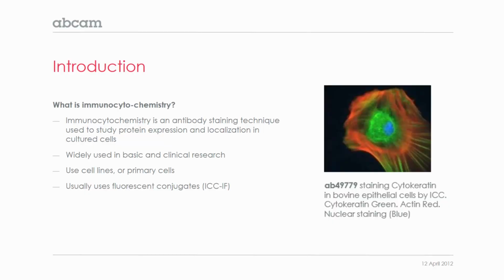So how do we define immunocytochemistry? We would classify it as an antibody staining technique that's used to study protein expression and localization in culture cells. It's very widely used in basic and clinical research now. Many of our customers are using this.